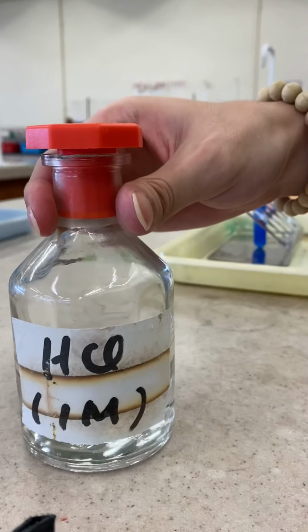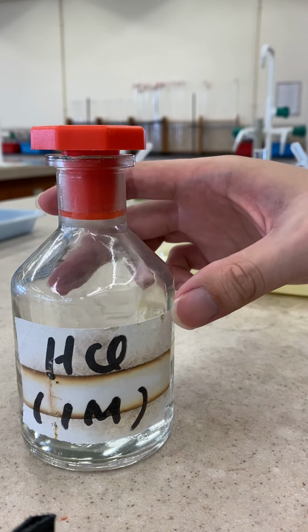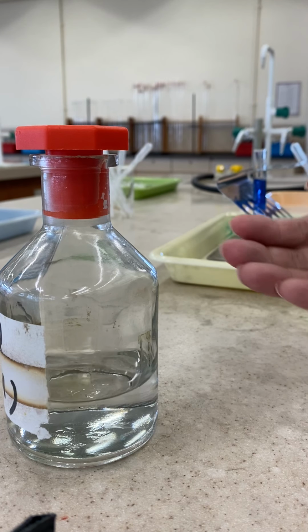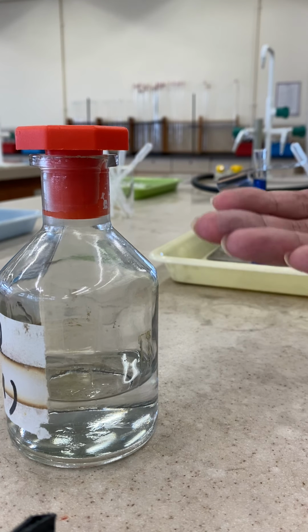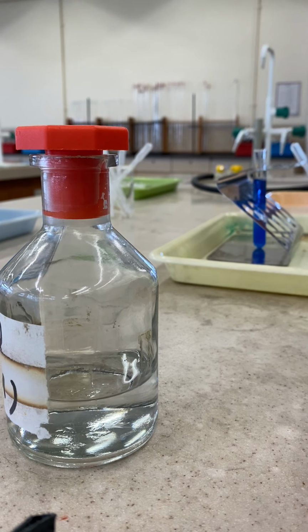Another reagent we will use is hydrochloric acid, the acid inside your stomach, your gastric juice, a colorless liquid. Again, these are physical properties of hydrochloric acid, a colorless liquid under room temperature, because when you are observing it, it is still hydrochloric acid without changing into something new.